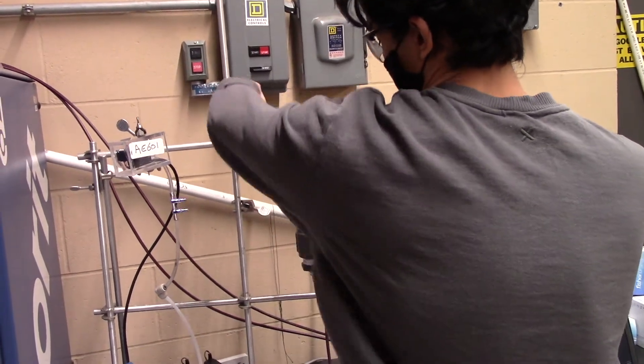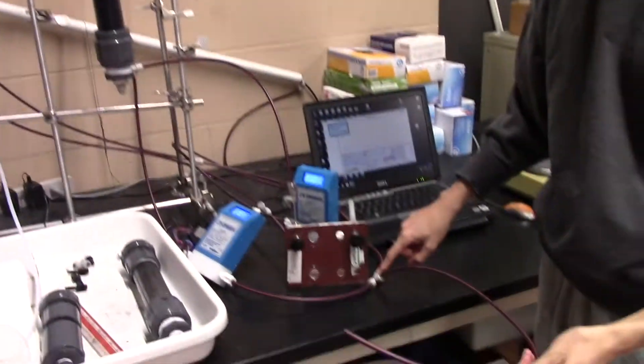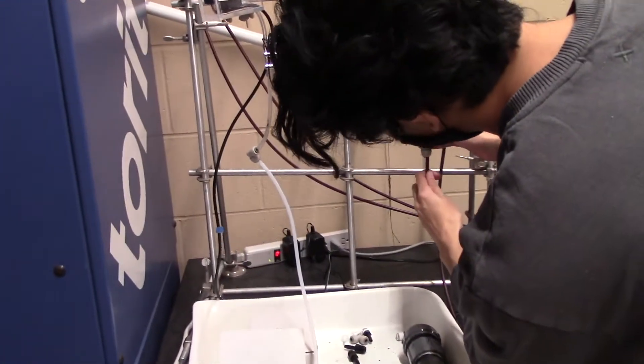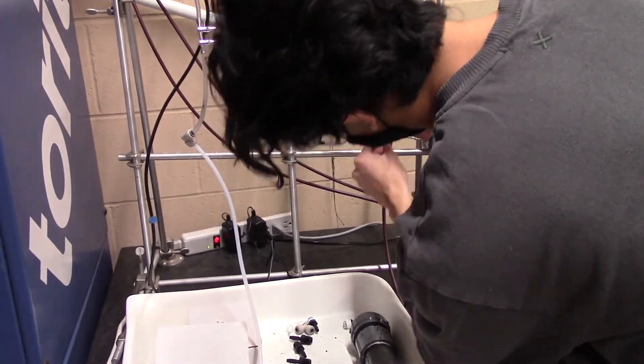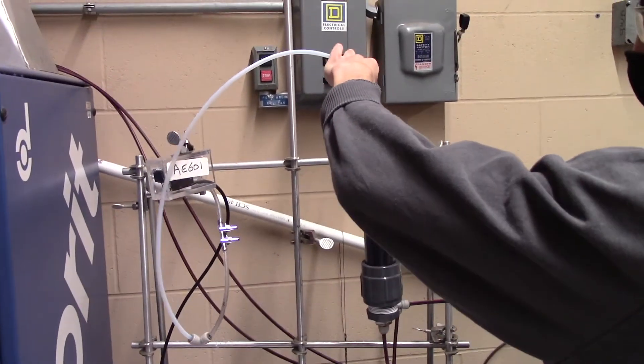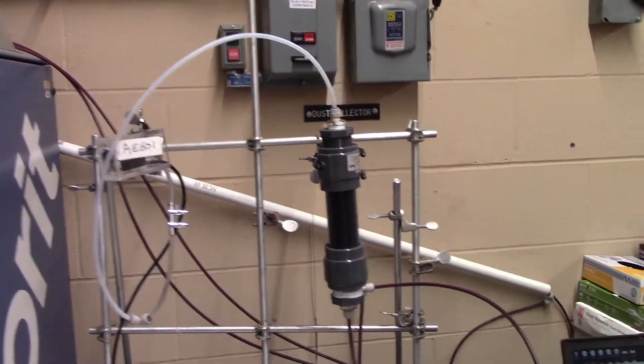Next, securely fasten the column. Once this is done, take the tubing exiting the three-way valve and attach it to the bottom of the column to flush it through with nitrogen gas. Then take the sensor tubing and attach it to the top of the column for the computer to receive the adsorption data.